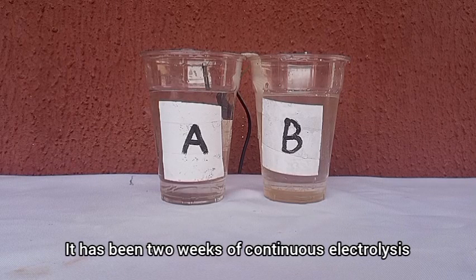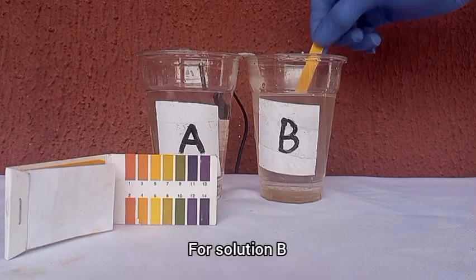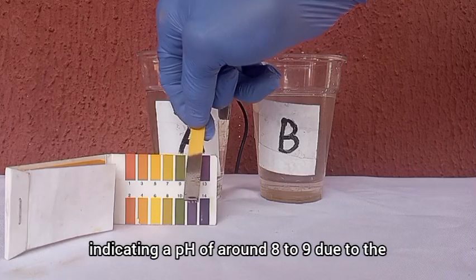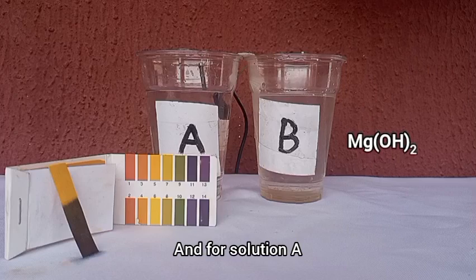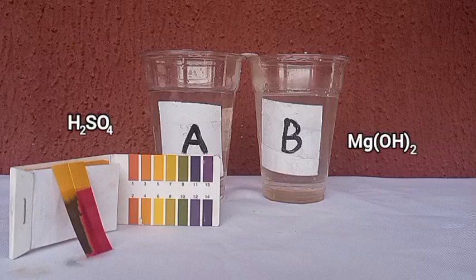It has been two weeks of continuous electrolysis, and now for the moment of truth. We check the pH of each solution. For solution B the paper shows green, indicating a pH of around 8 to 9 due to the insoluble hydroxide formed. For solution A the paper shows a deep red due to the strong acid formed.